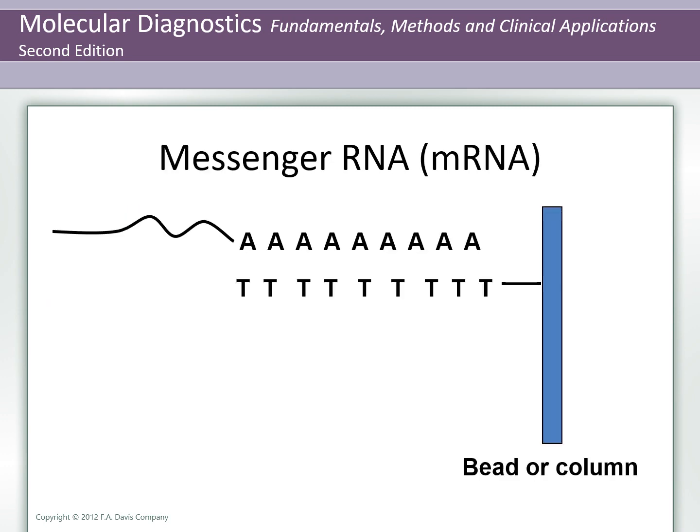Often, the RNA needed for analysis is messenger RNA, which accounts for only 2.5 to 5% of the total RNA yield. To enrich the yield of messenger RNA, protocols employing single-stranded oligomers of thymine or uracil, as seen in this figure, immobilized on a matrix resin column or beads are used. The poly-T or poly-U oligomers will bind the poly-A tail found exclusively on messenger RNA. After washing away residual RNA, poly-A RNA is eluted by washing the column to break the hydrogen bonds between the messenger RNA and the column.